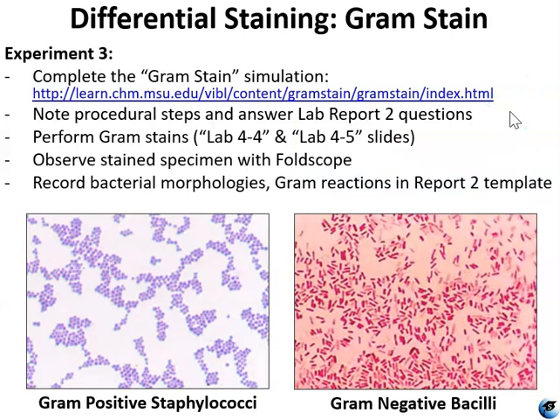For experiment 3, you will first complete a gram stain simulation, which is going to be at this link here.